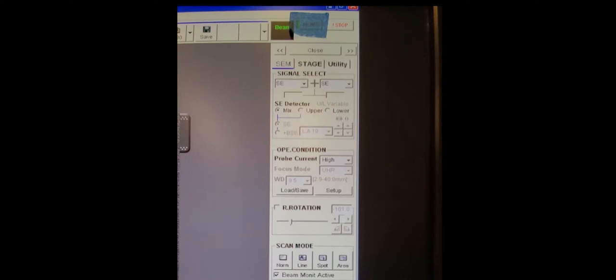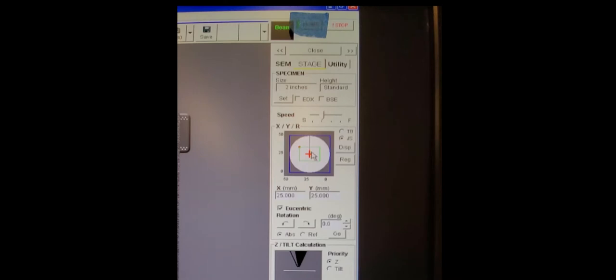So before you load the sample, there's a couple of things you need to check. Over here on the right, we're going to go to the stage tab, and then we're going to make sure that the specimen size is correct. And then below that is the stage position. We want to make sure it's at 25 on the X and 25 on the Y. This ensures that when we push the rod in to unload the sample, it goes to the correct spot.